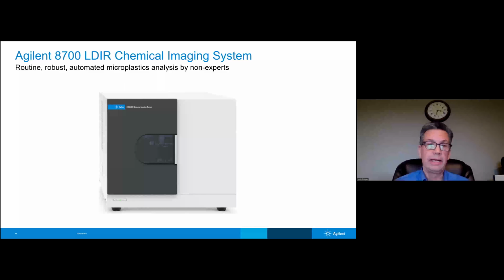Advantages of FTIR: it's going to cover a very broad wavelength range, the entire infrared spectrum from 4,000 wave numbers probably down to 700 wave numbers. This system is using a quantum cascade laser, so we cover most of the mid-infrared fingerprint region from 1,800 to 975 wave numbers, which is a region where most of the peaks occur that you need for identification. So probably a slight advantage of FTIR at that point is it has a broader region of collection. Disadvantage of FTIR is that the source is weak.